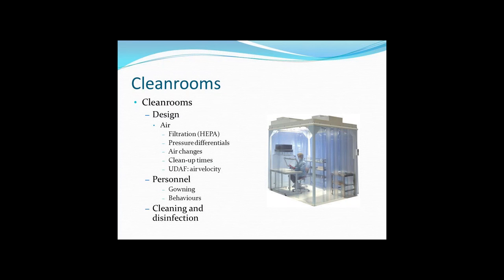Clean rooms are also designed to have efficient cleanup times. This means that if a level of particles is generated that takes the room above its classification, that within a set period the level of particles drops down below the safe level. There are also pressure differentials which help with air direction to ensure that the air from the cleaner area always blows outwards into a less clean area.